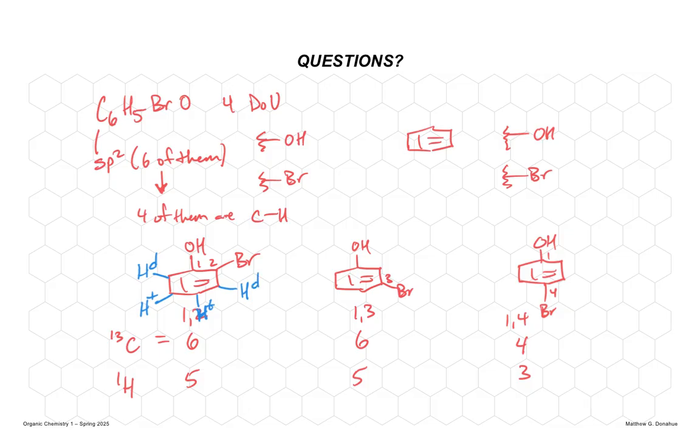Let's do the same for the 1,3 isomer to see if we can now differentiate. Is there a difference, or is this going to give the same patterns? So the hydrogen here, that should be what? A doublet. This hydrogen, triplet. This hydrogen, doublet. And now what about this one? Singlet. So there's our difference. That's how we can rule one of them out and then confirm the other.